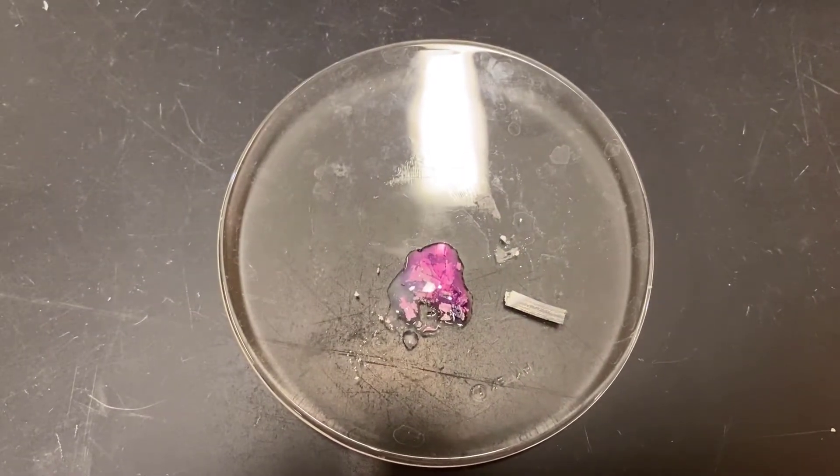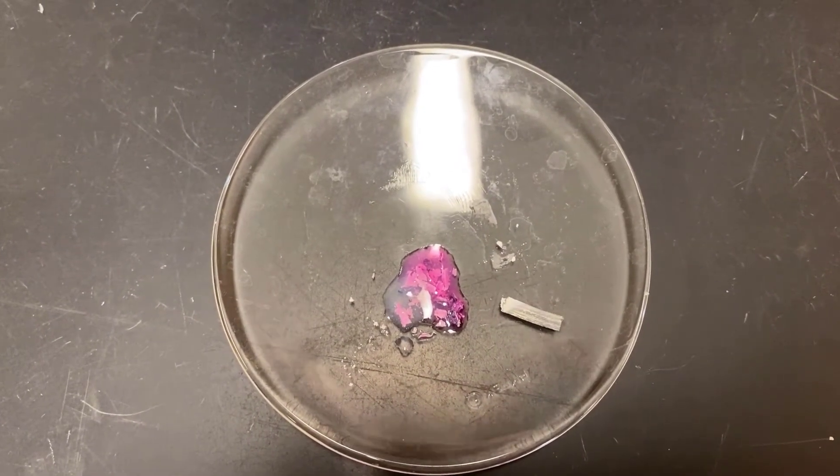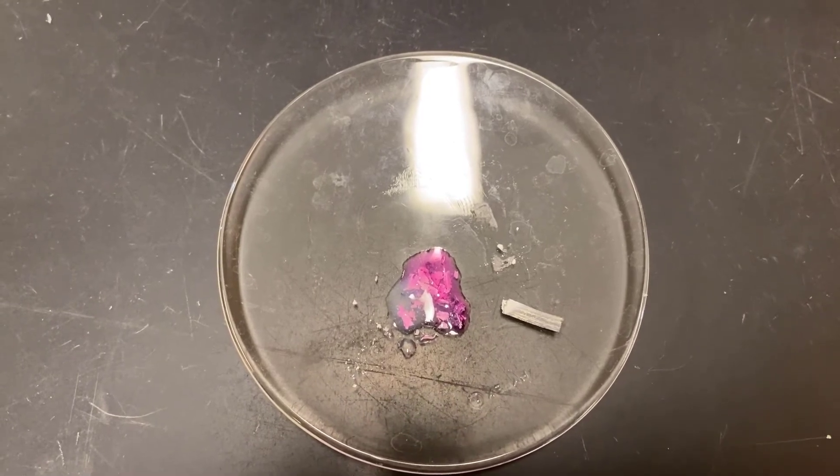And it turned pink! So we now know that we have made a new substance — the metal hydroxide, the base.